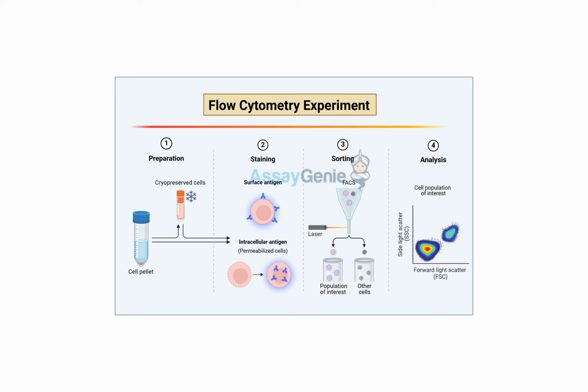Exactly. And I imagine with ICFC, we could even track how individual cells respond to different treatments, like in real time. It's like personalized medicine, tailored to each patient based on their own unique cellular makeup. That's amazing. And don't forget about immunotherapy.